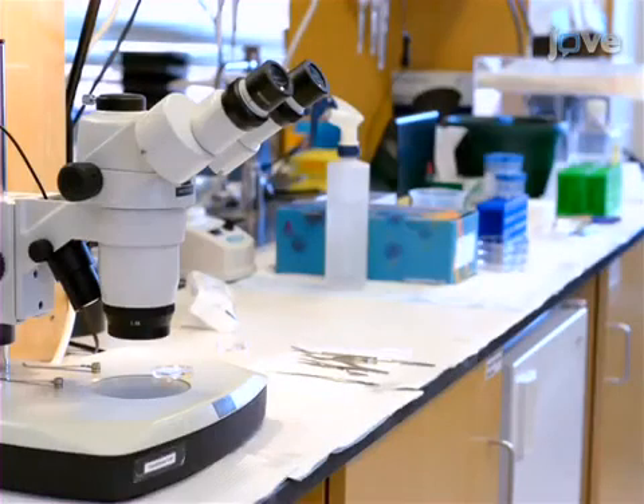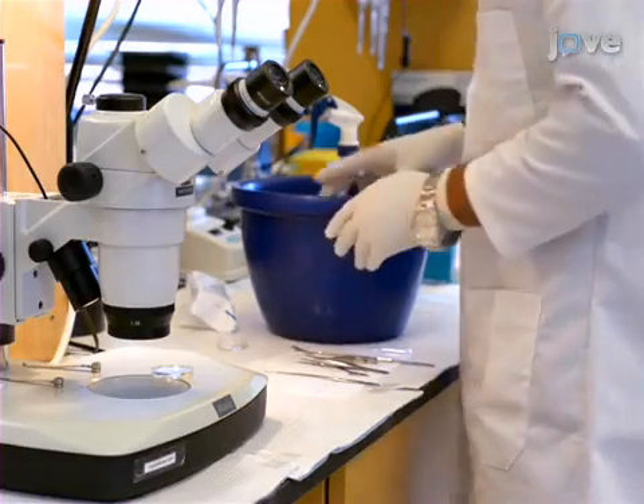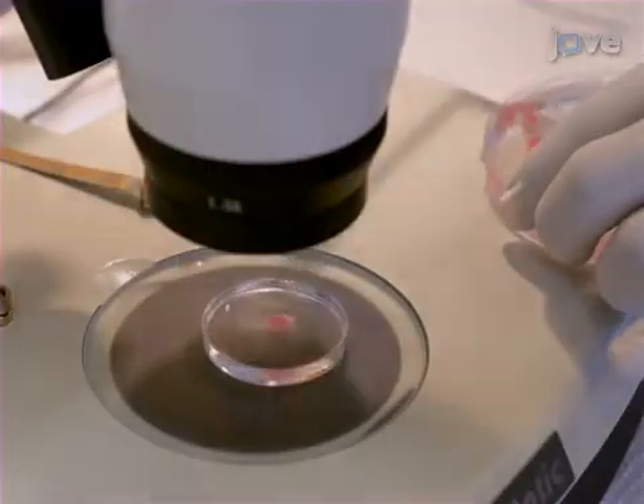For this protocol, have heads of E15 pups from CD1 dams in ice-cold PBS. Under a stereoscope, remove the brains with fine micro-tips.